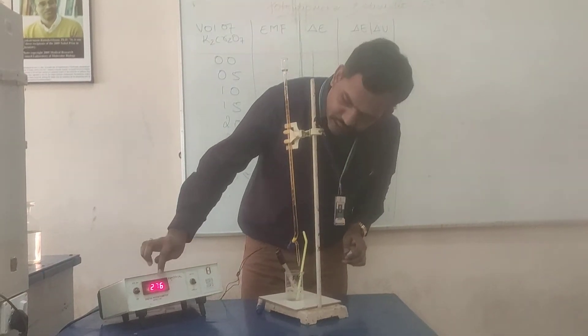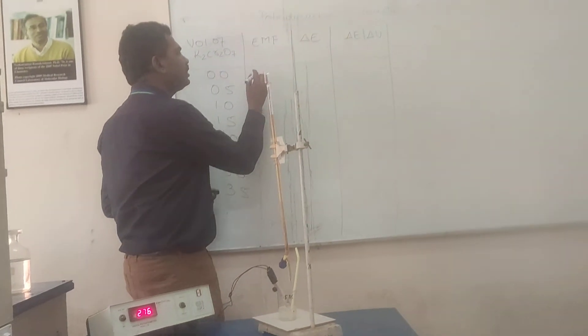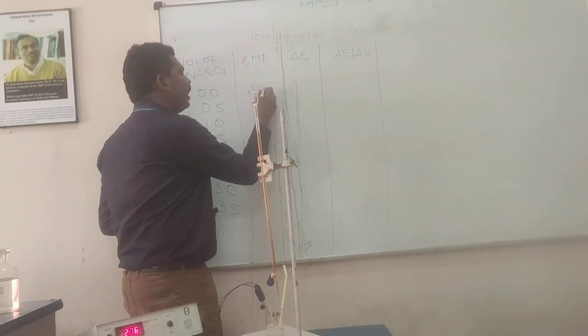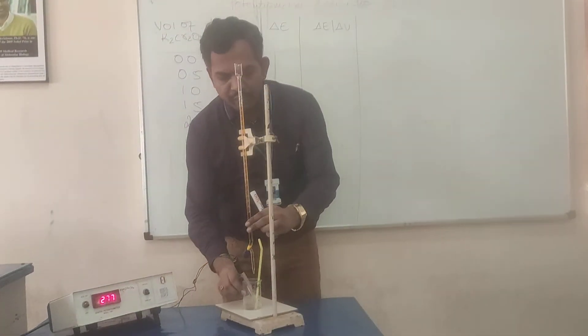So, this zero reading has 278. Before adding potassium dichromate, it has 278. So, we are going to add potassium dichromate with the increments of 0.5 ml.